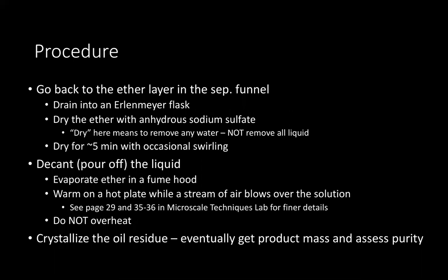Finally, go back to the ether layer in the separatory funnel. Drain it into an Erlenmeyer flask and dry the ether with anhydrous sodium sulfate — drying here means removing water, not all liquids, so you should still have a liquid after drying. You won't need a lot of sodium sulfate; usually a pea-sized amount is sufficient. Dry for about five minutes with occasional swirling so that small water molecules trapped in the ether layer can be absorbed by the anhydrous sodium sulfate.